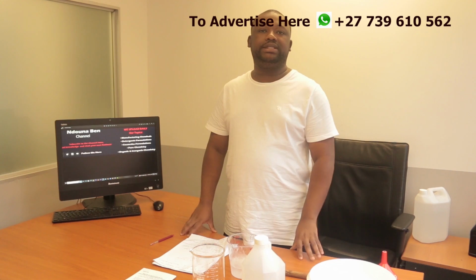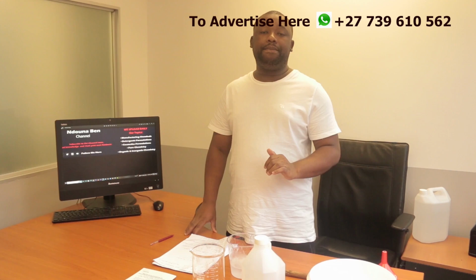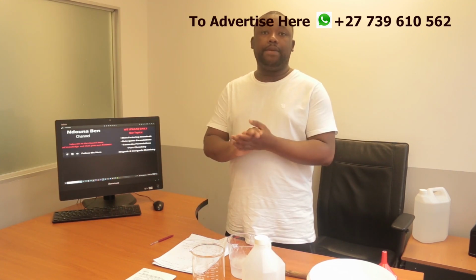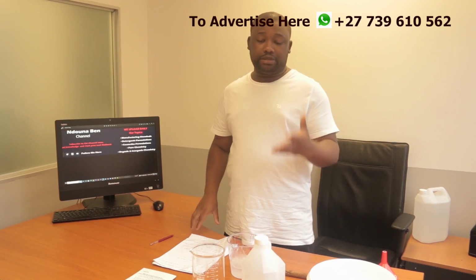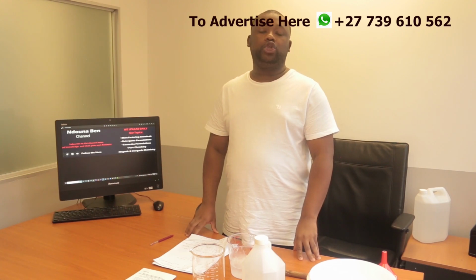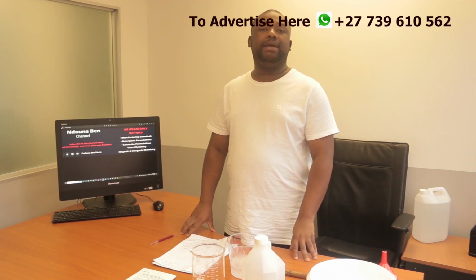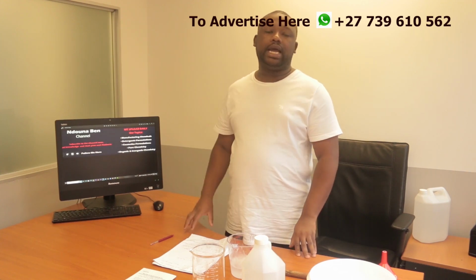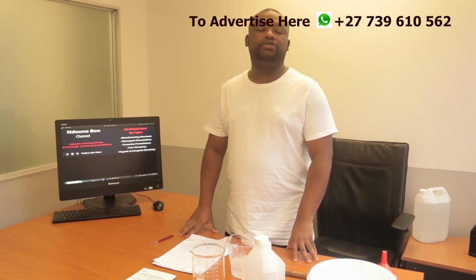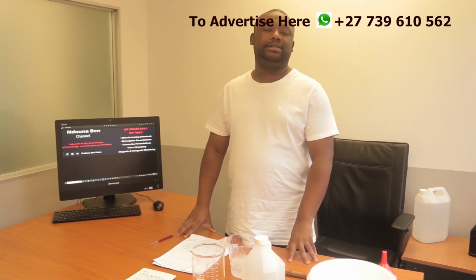And why 70%? Simply because it's a very good germ and bacteria killer. It kills germs within 1 minute, and this has been used even in hand sanitizer. So you wonder how they are getting 70% isopropyl alcohol? Simply by diluting a concentrated alcohol, and it's what I'm actually going to show you in this video. Make sure that you remain tuned till the end so that you can master this.